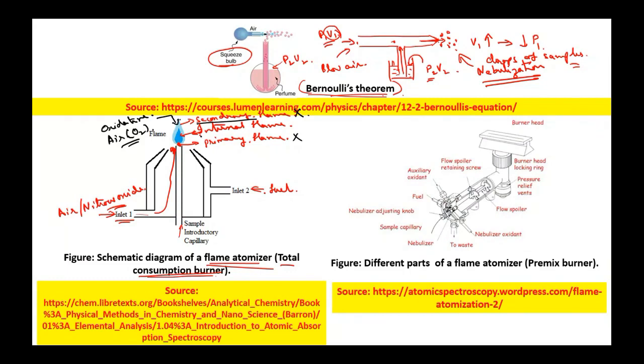The reading is taken from the internal flame, wherein it is expected that complete combustion of fuel has taken place.